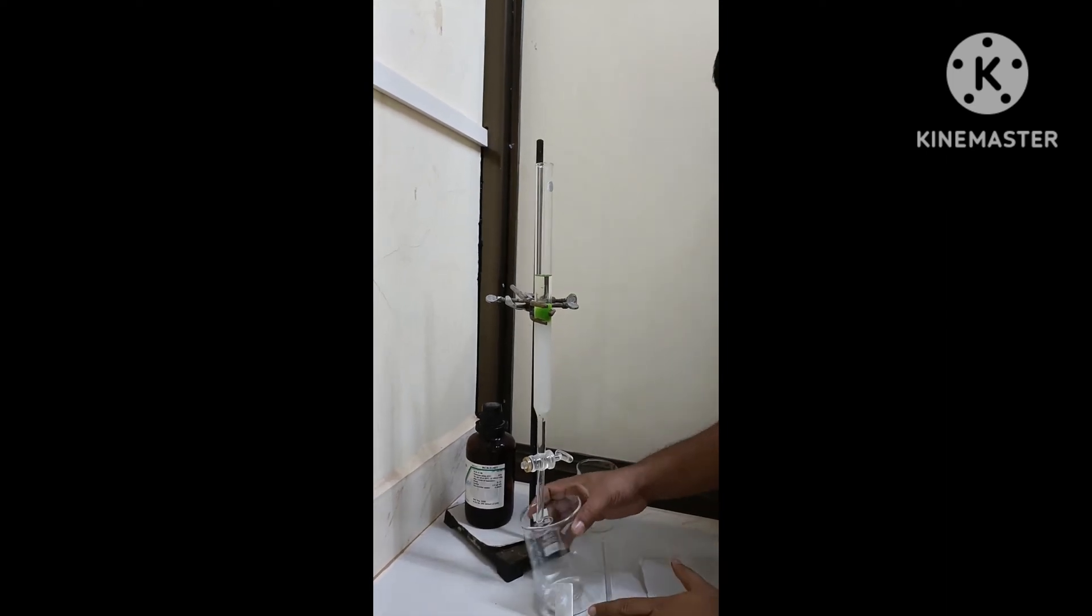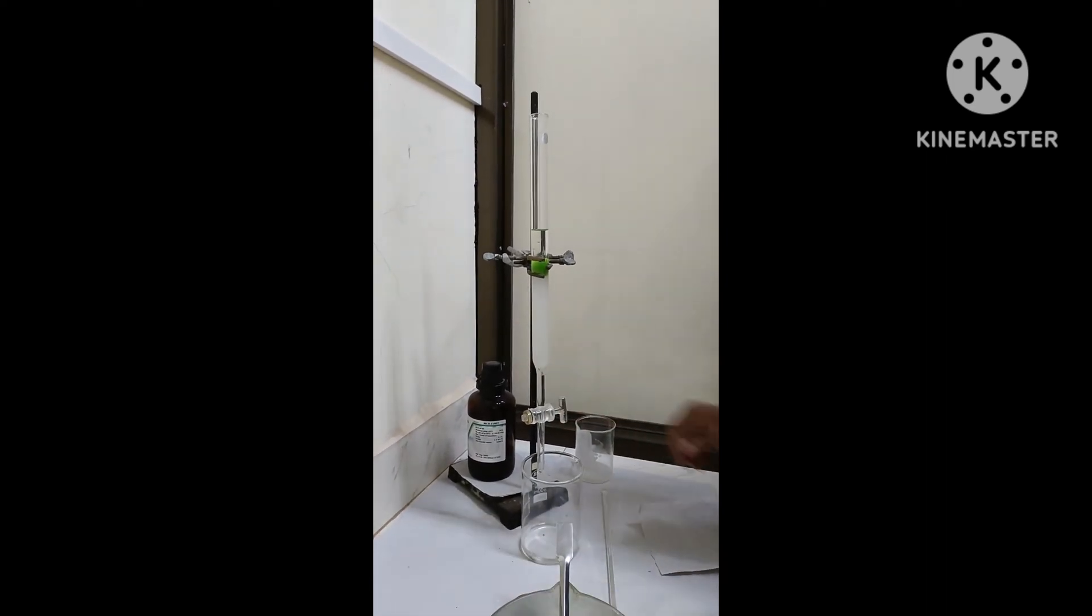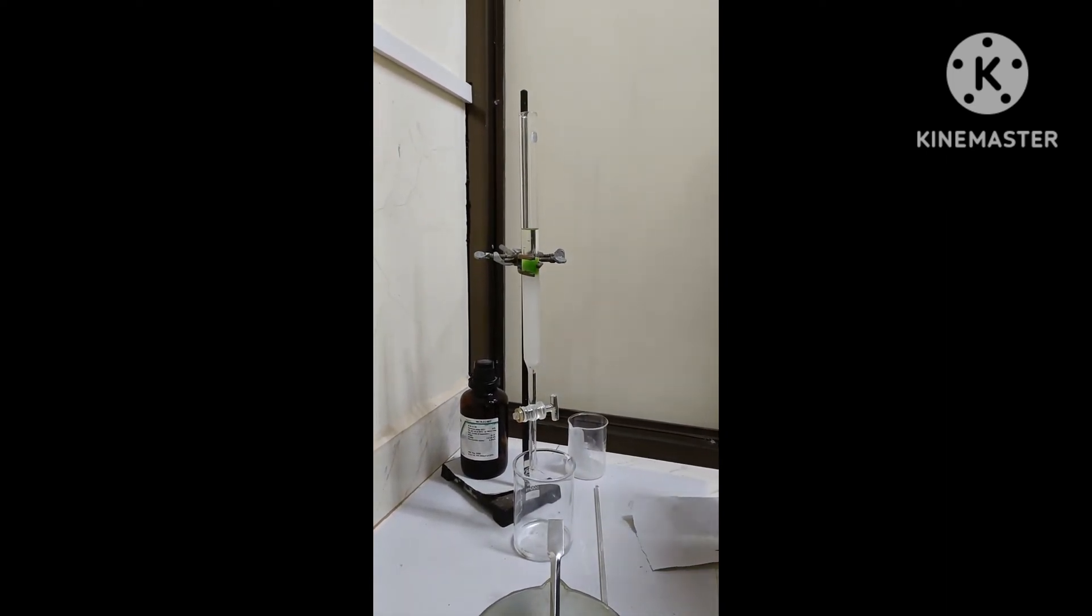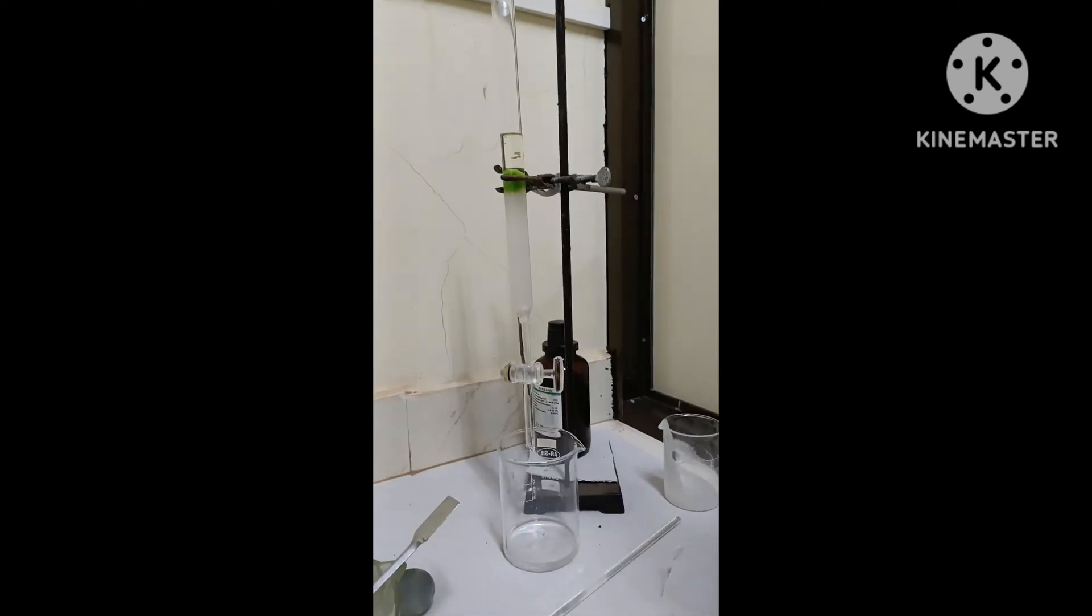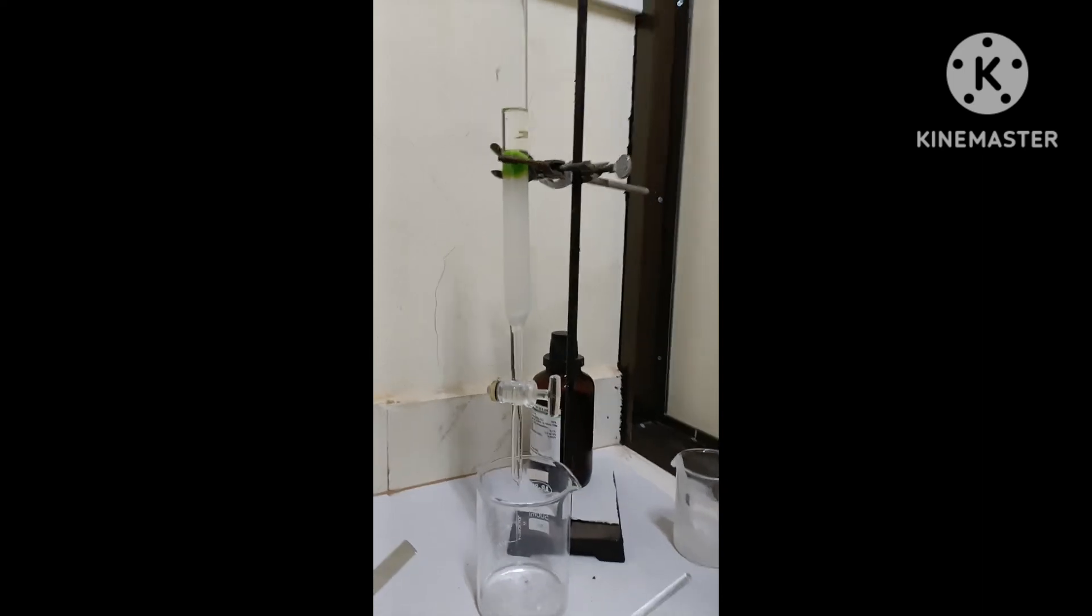The sample will settle down properly, and then again, we can add the silica slurry so that when we add the solvent system or the mobile phase, it will not disturb the column.